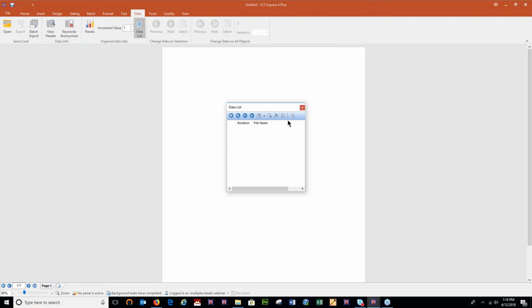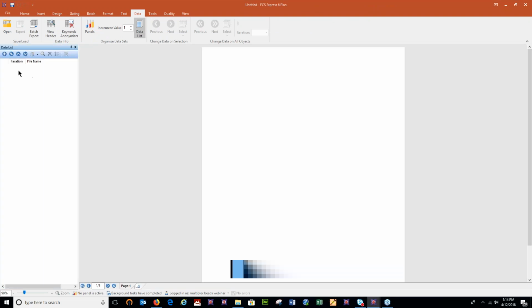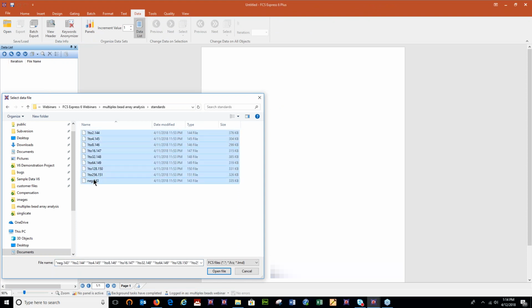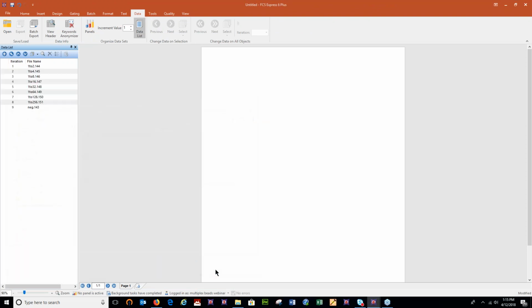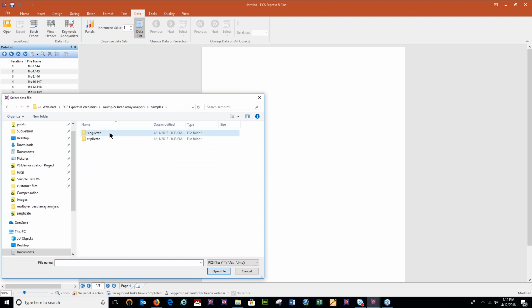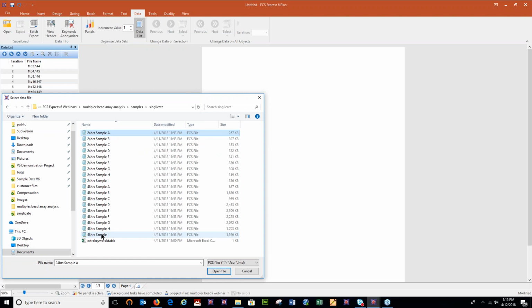And we'll open our data list, and let's load in our files. So let's load in our standards from here. These are our serially diluted standards. And I'm going to load in my samples as well. Okay, we'll take all of these 24-hour and 48-hour samples.